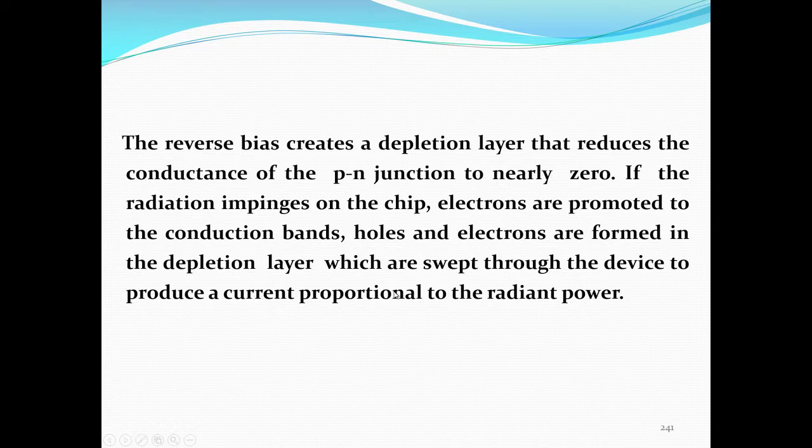Very simple mechanism, and it is basically a physics concept, PN junctions. You may read more about it in physics textbooks: what are P conductor and N semiconductor, PNP junction, transistors, etc. A very well known technology, but it has been used in instruments only for the last 20 years.